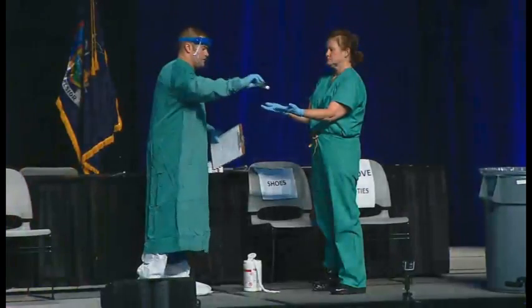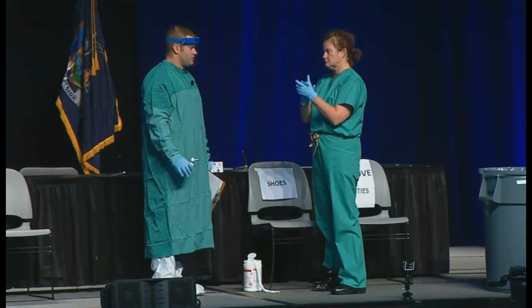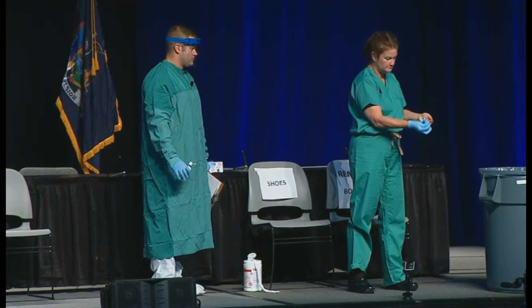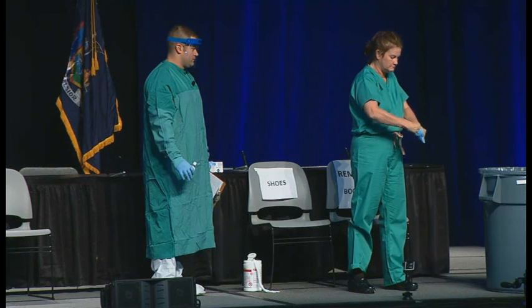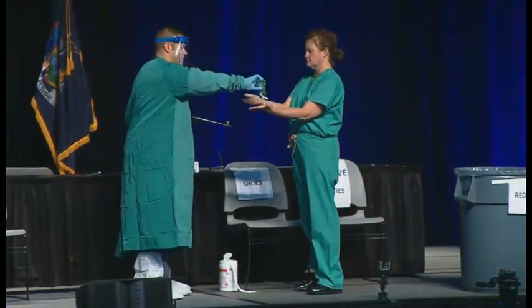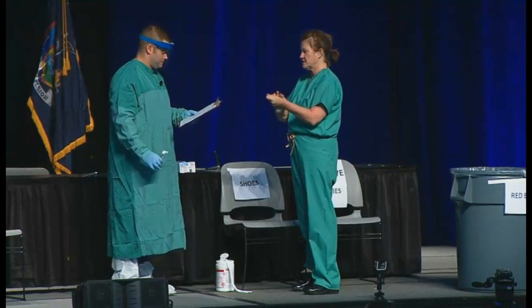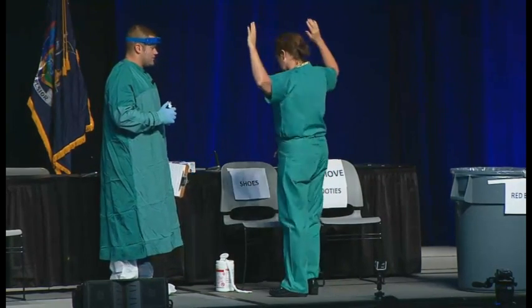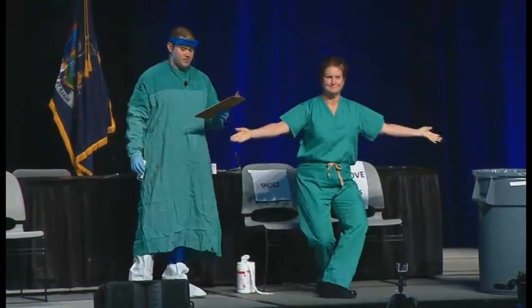Barbara is going to do hand hygiene with the gloves on, and then remove the inner gloves. We're going to perform hand hygiene on the bare hands. We're going to do one final inspection of Barbara to make sure she doesn't have any visible contamination on her scrubs. Everything looks good. Please give her a round of applause for our model — Barbara Smith from Mount Sinai.